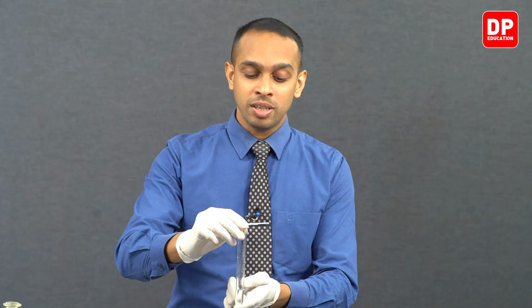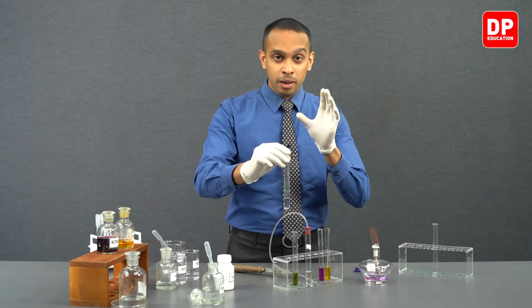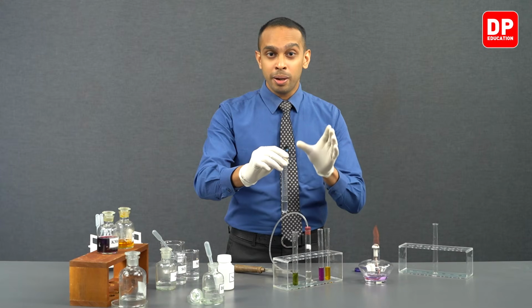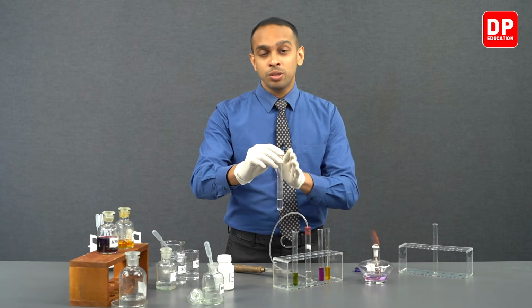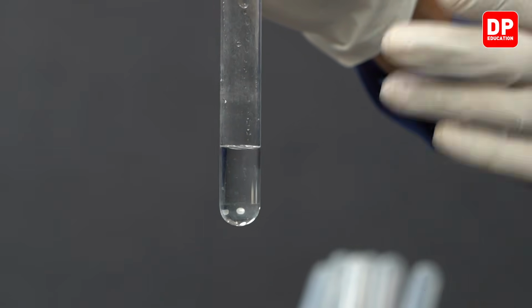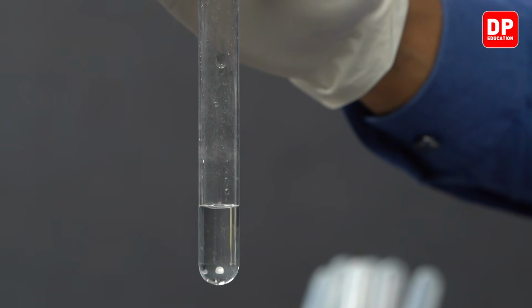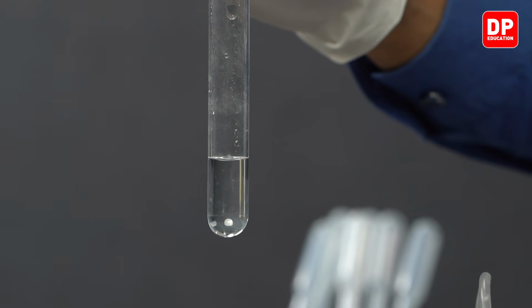This color intensity is very low. We will not observe that color. Instead, we observe the formation of a colorless solution. So permanganate ions that are purple in color got reduced to form Mn2 plus, and that is why we can see a colorless solution here. And sulfur dioxide got oxidized to form sulfate ions.